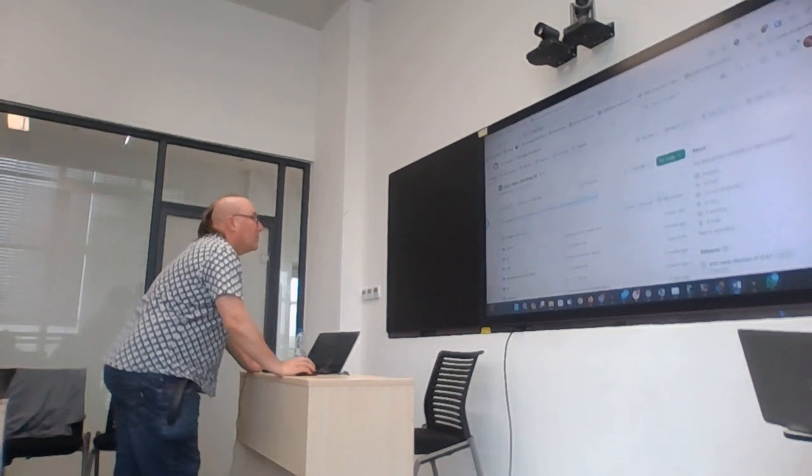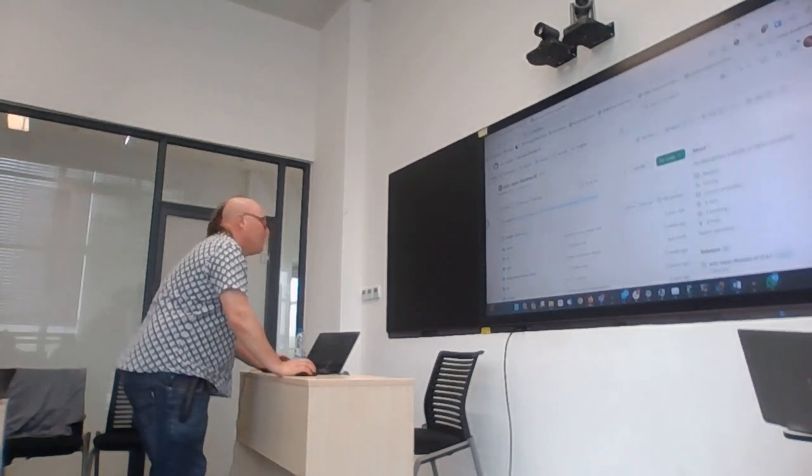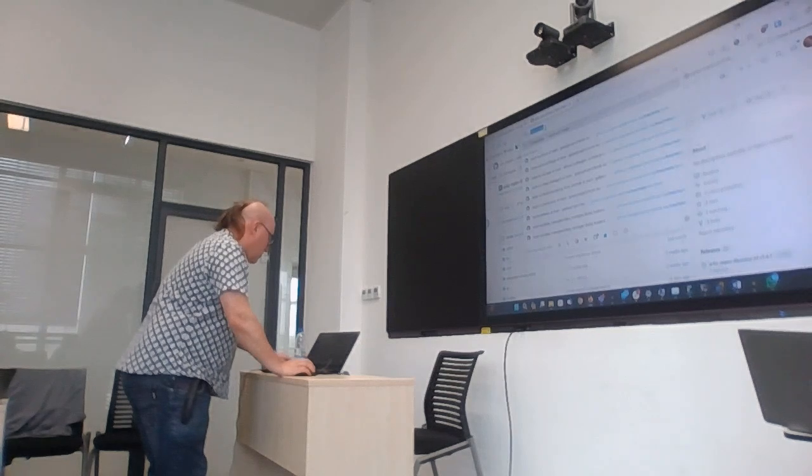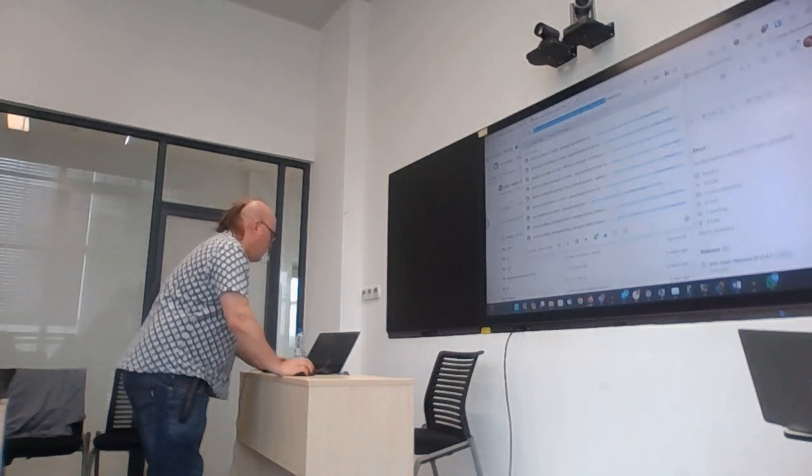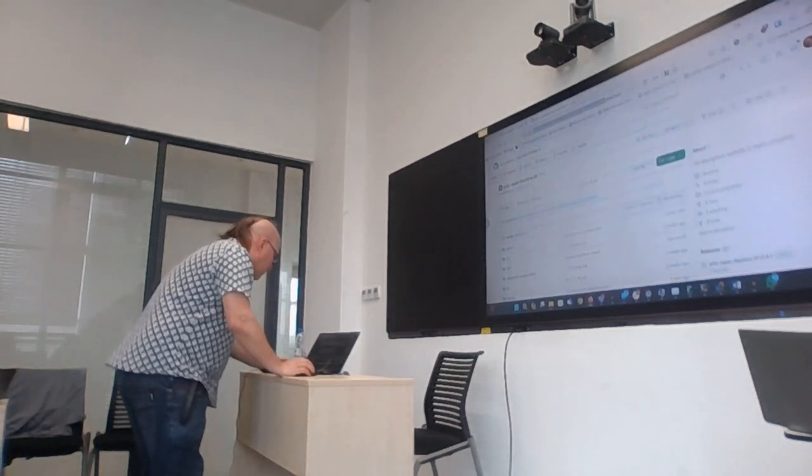Sorry, I typed the wrong thing here. Undo. Reload. We go to my Epi2Me.